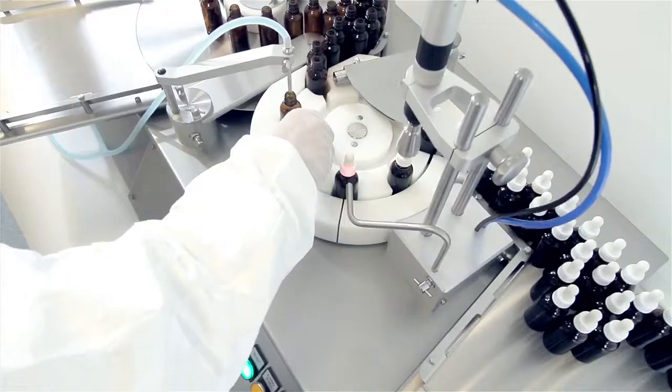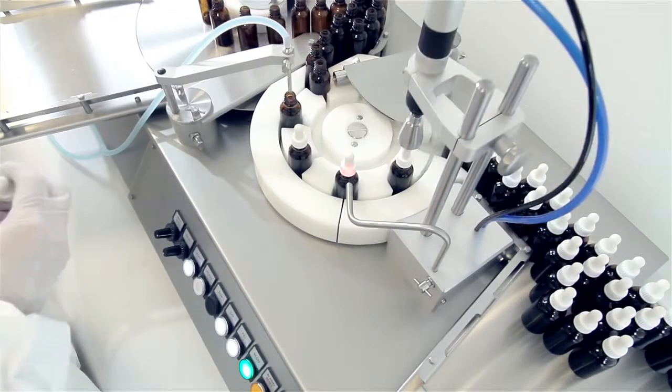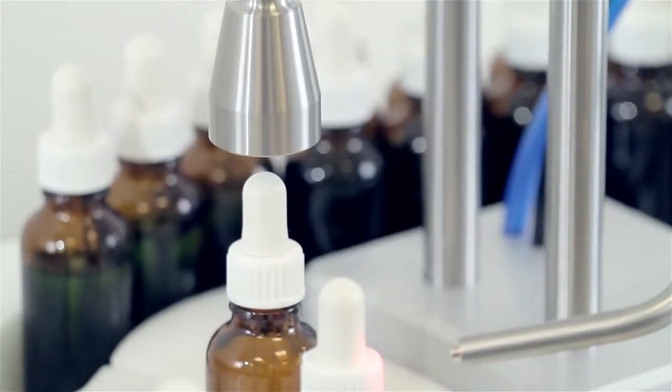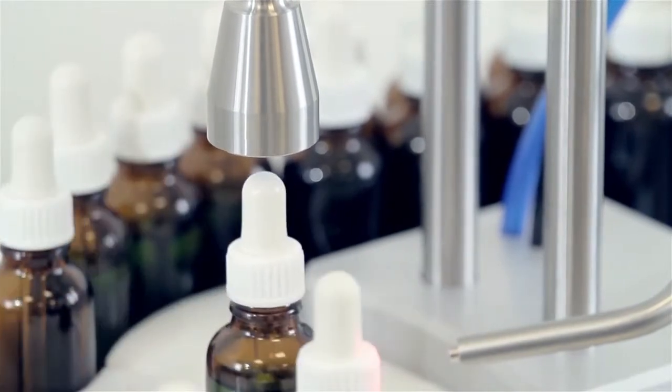Filled and capped bottles leave a standard FlexFeed 30 on trays. However, the machine can be customised with bottles being fed onto a conveyor into a labelling machine, further improving productivity.